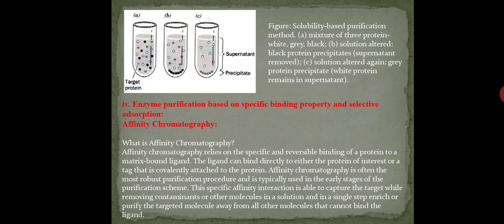So now the interaction will not be between water and protein, it will be between protein and salt, which will help the protein to stabilize its structure. And once the protein structure has been stabilized, it increases the solubility. As I told you earlier, low salt concentration facilitates stability and helps the protein to stabilize the structure. So it increases the solubility, which is known as salting in.